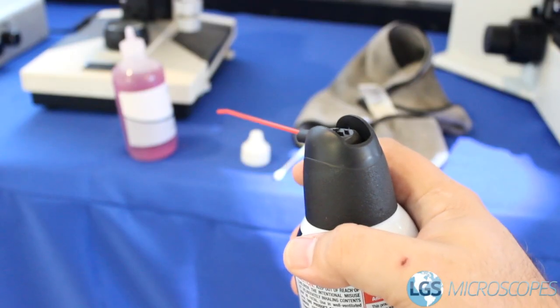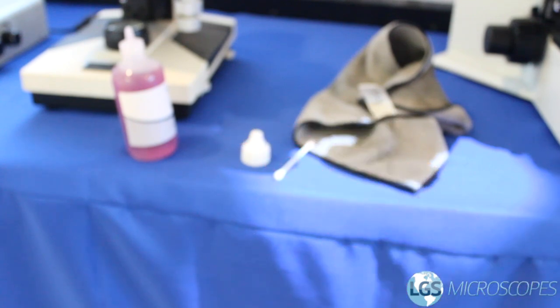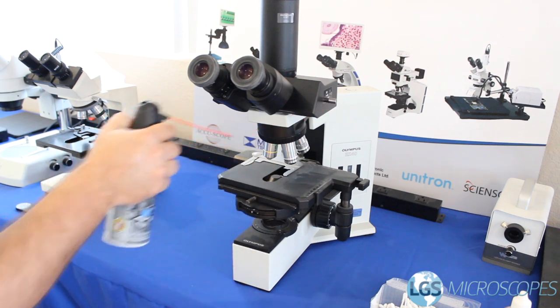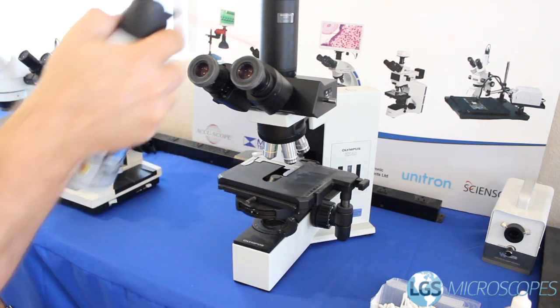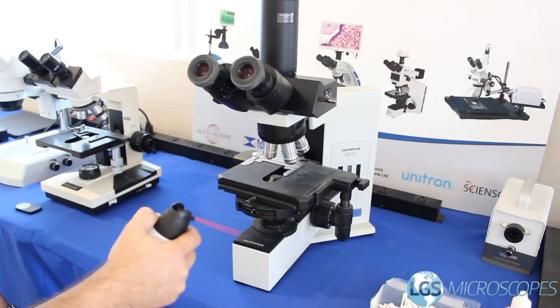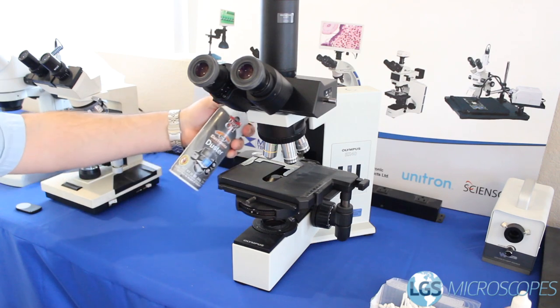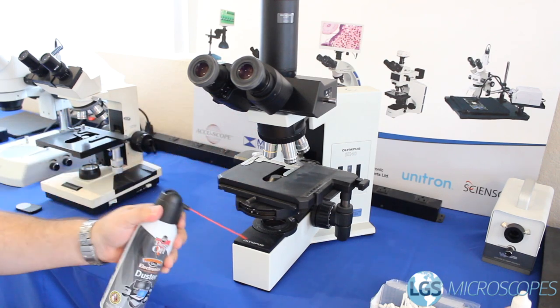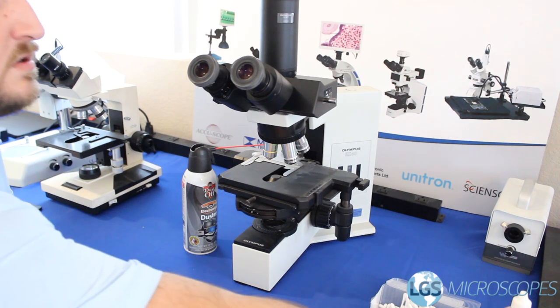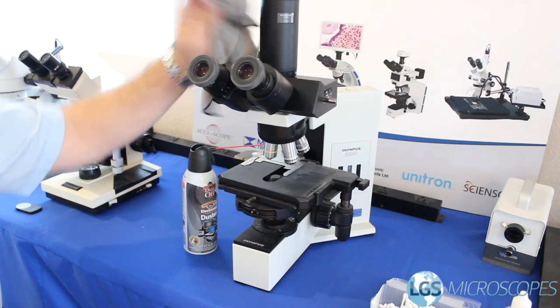We're going to begin by grabbing our can of air and shooting a couple shots out to the side just to make sure it's clear of any condensation that might be inside of the straw. Take your can of air and just spray it down. Try to get in the little cracks and crevices. This microscope is really dusty.